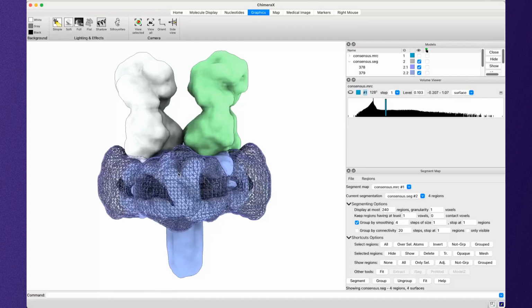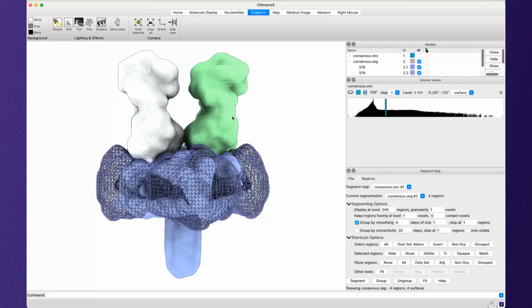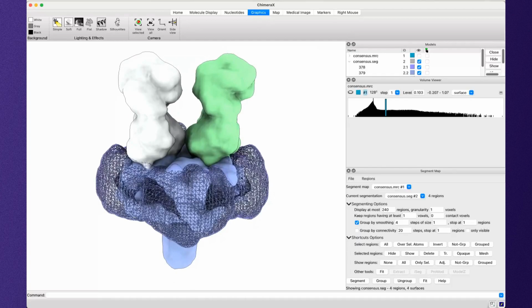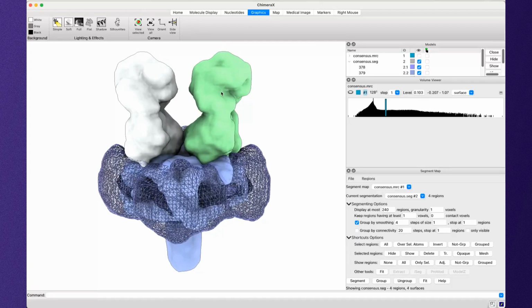One thing I want to point out here is that you'll notice I did try to create as few segments as possible, right? In this example, we have only 4 segments. I could have just left the segmentation as is and then told CryoSPARC which segments I wanted to fuse to which other segments. But A, that creates a lot more work for you in typing together these fusion parameters that we'll describe in a second.